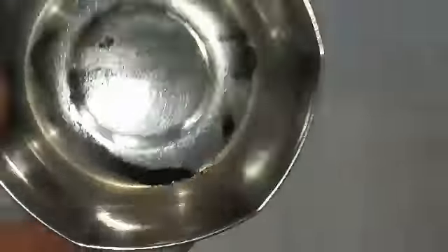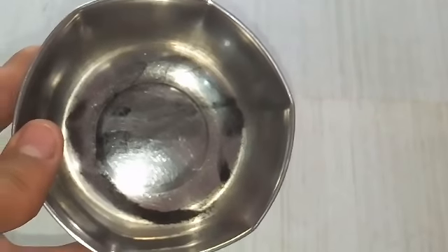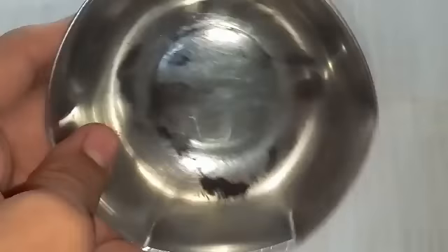And this is not actually a good amount of carbon, but you can use this for few times for experiments, only 1 or 2 times to be sure. But this is how you can make carbon from naphthalene balls.